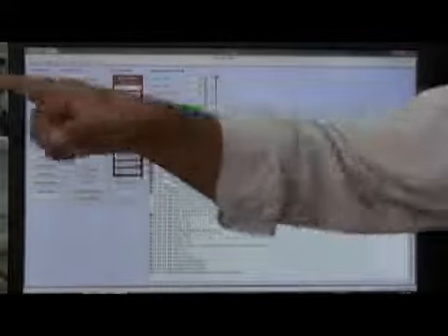You have to do this at least 10 times, better 20 times. After making it 10 or 20 times, you have to wash the buffer loop. 2 times is enough. And then 2 times external wash. All these 3 steps are from the same syringe. Forget the small bottle now.